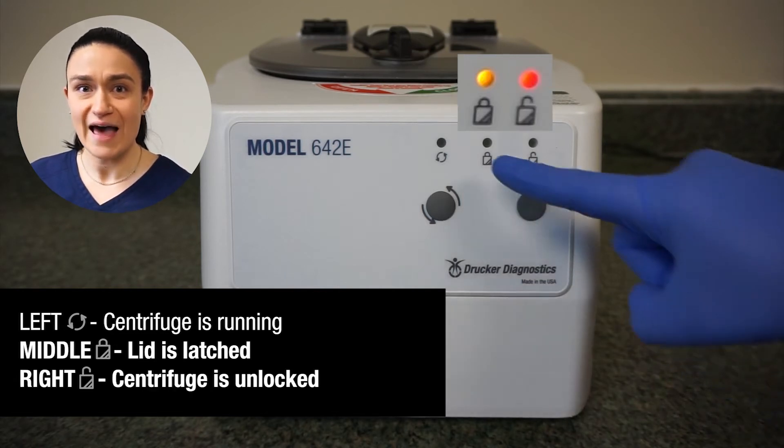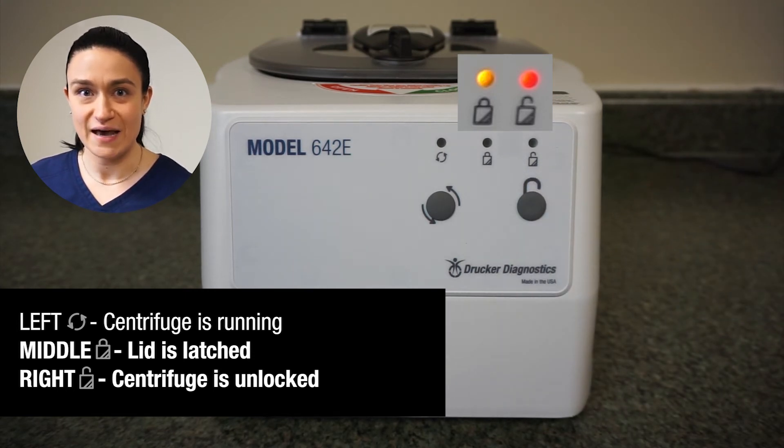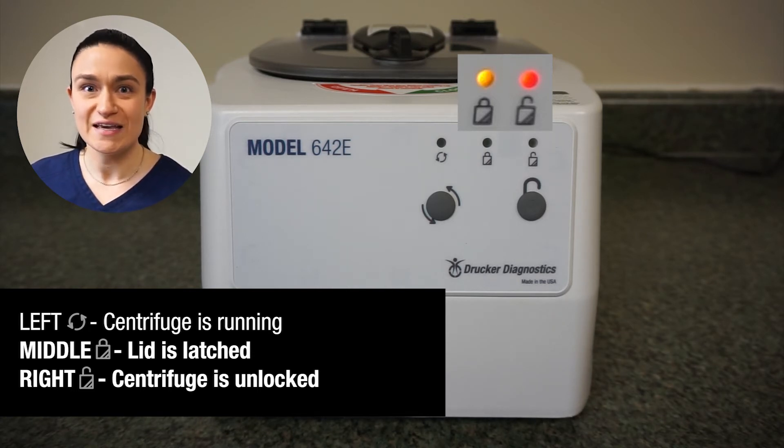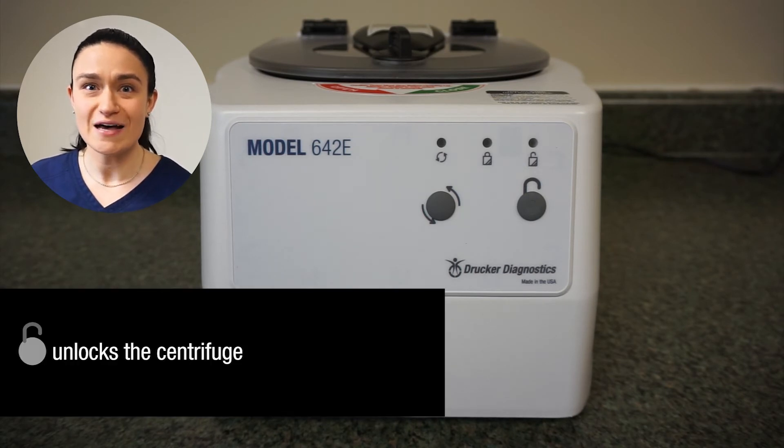The center latched and right unlocked LEDs may also be illuminated at the same time, because the lid can be latched even while the centrifuge is unlocked. If that unlocked LED is illuminated with the latched LED illuminated, that means you can turn the lid latch a quarter turn counterclockwise to unlatch it and open the lid. If that unlocked LED is not illuminated, you will have to first hit the stop unlock button to unlock the centrifuge before you can open the latch and open the lid.